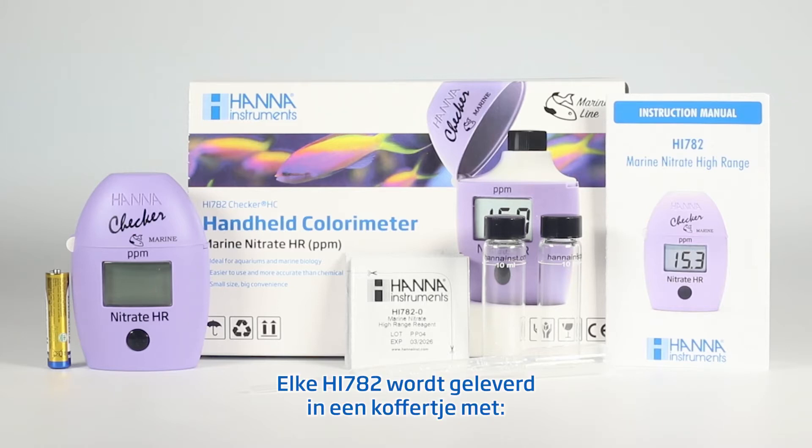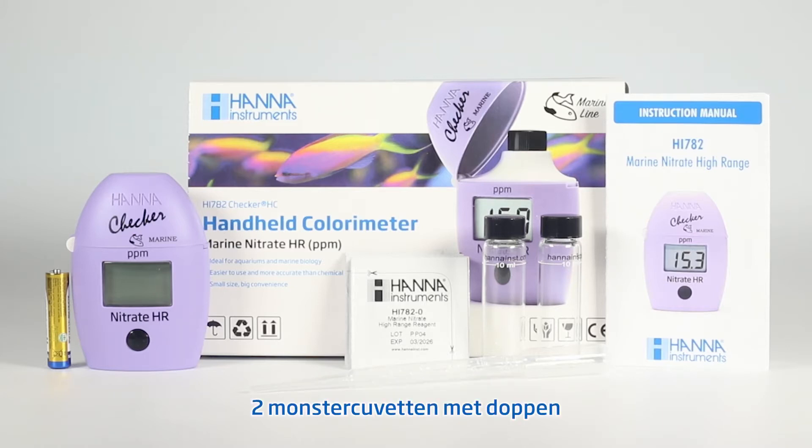Each HI782 is delivered in a case with 2 sample cuvettes with caps, 10 test reagents, 1 3-milliliter pipette, 1 AAA alkaline battery, and your instruction manual.